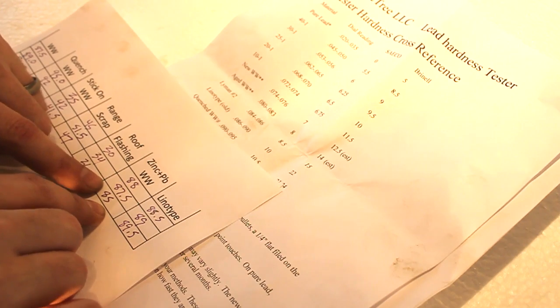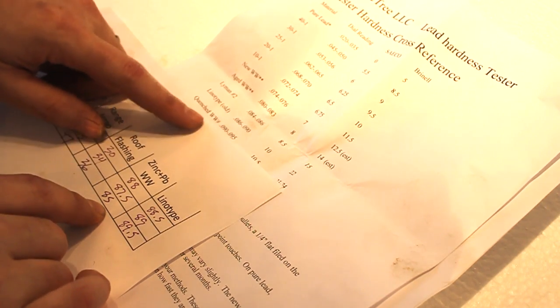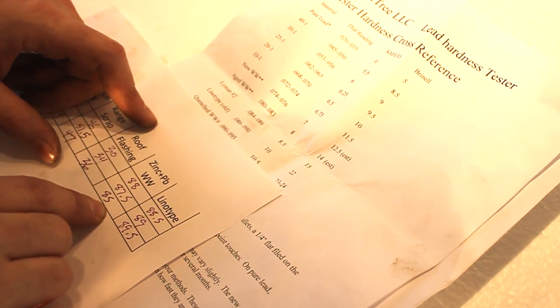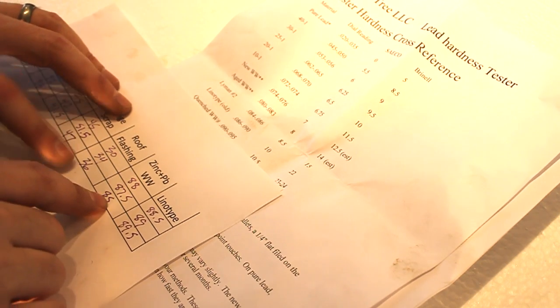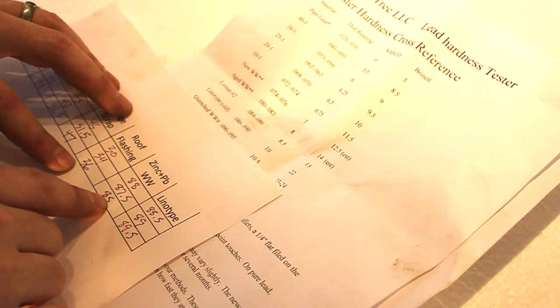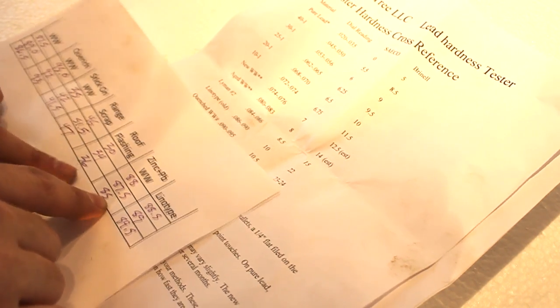The zinc contaminated wheel weight seems to be reading in the high 80s, which I don't know what it should read. I suppose that's probably accurate. I would think that zinc added to lead would probably make it harder, so it seems okay to me.